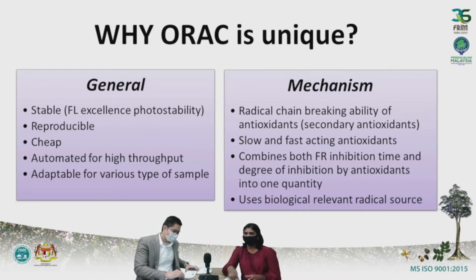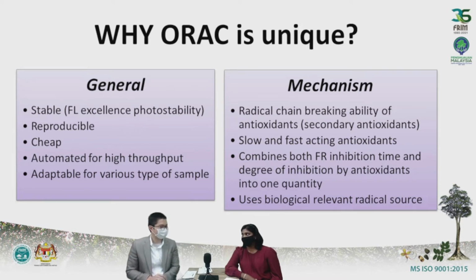So the next topic that I would like to cover is definitely on the relevance. In the last few years there has been some academic discussion that warned against overstating the importance of the ORAC value itself. So Shalini, in your view, is ORAC still a relevant assay for academics as well as for the industry?